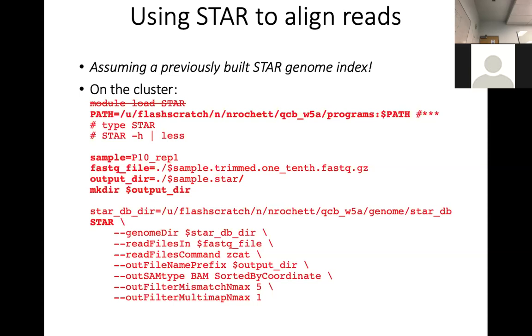Oh, you were just working. So now you're going to have some files, but we don't have all the files yet. So we have all these weird files.